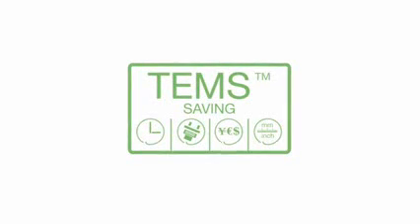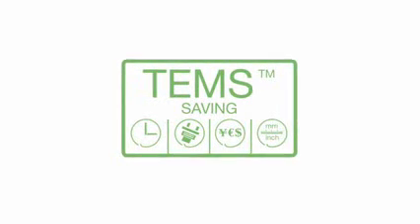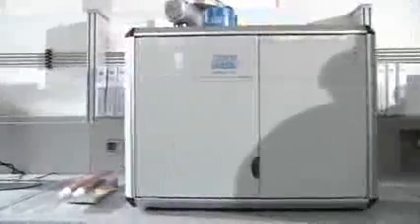The NDA701 incorporates the exclusive TEMS technology, saving time, energy, money and space. The NDA701 Dumas nitrogen analyzer is the comprehensive response to the need to produce accurate and reproducible results in an automated and simple way according to international standards.